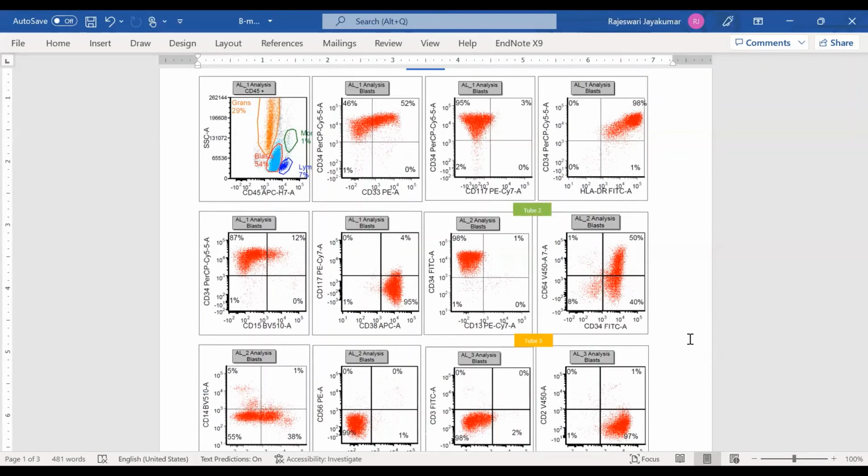And one other thing you have to remember is when these patients relapse, they can either relapse as just ALL or just AML. They can have either a lineage switch, or one lineage can still persist after treatment. So you have to keep that in mind, and don't expect the relapsed specimen or your follow-ups in MRD to have the same phenotype. It can be just one lineage blast. And when that happens, you can see additional expression of markers that are associated with that lineage and loss of markers that were previously positive from the other lineage.